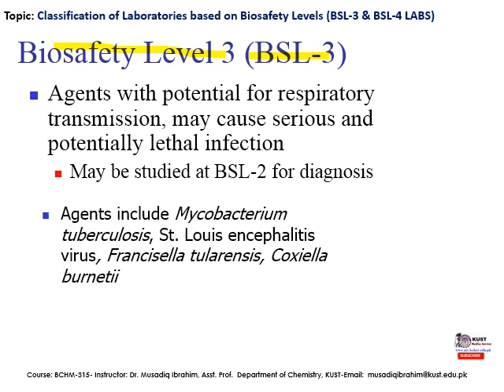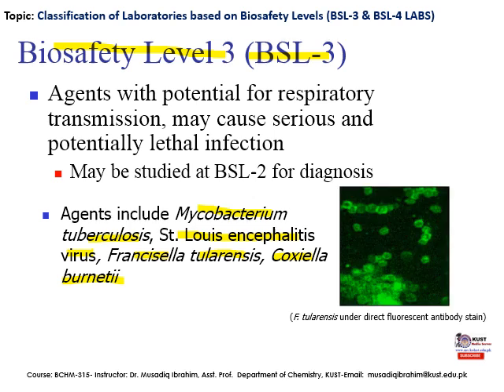Now, agents studied in BSL-3 labs include Mycobacterium tuberculosis, St. Louis encephalitis virus, Francisella tularensis, Coxiella burnetii. Now, it is important to see the image of the Francisella tularensis under the direct fluorescent antibody stain.